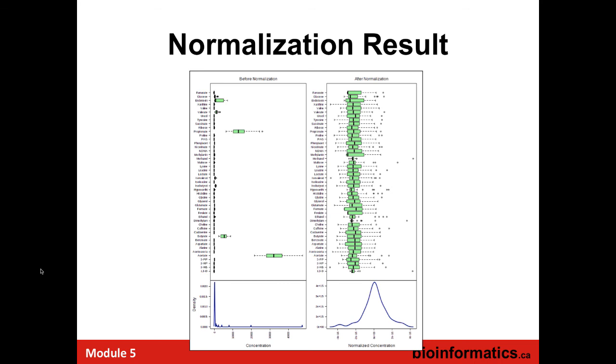Just to follow up on that, yes. Would you recommend this visual interpretation is enough, or would you run normality and homoscedasticity tests? You could, it's just that we don't have that in MetaboAnalyst. Some people have done that, and this is something you could bug Jeff to add, at least to generate that. Multivariate normality, I don't think there's a solution. That's individual, right? But individual normal distribution doesn't guarantee multivariate normal distribution. You shouldn't focus too much on it.